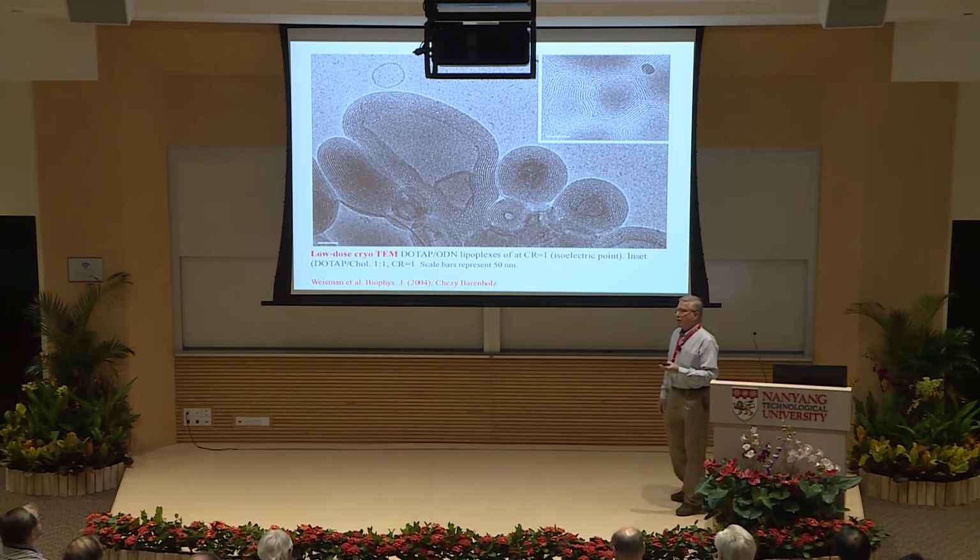The other thing that I would like to mention is that this is taken at low temperature. It's kept, as I said before, in the microscope at low temperature. And we use no stain whatsoever, no stain that may actually alter the specimen.